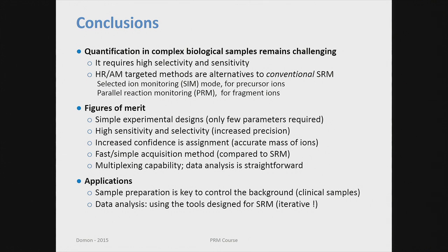Most people have switched to PRM, but there are still a few instances where the SIM mode can be useful, because you can get reasonably good resolution and separation, and the intact precursors actually give you roughly a factor of 10 in sensitivity compared to the MS/MS, right? Because on average you fragment your precursor into 7 or 8 fragments, and you distribute your signal. So if you look for ultimate sensitivity, SIM is still a reasonable option.